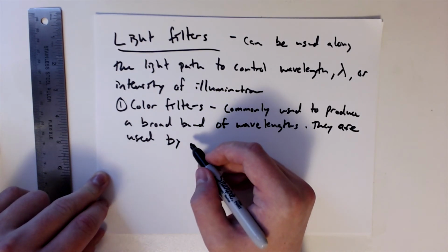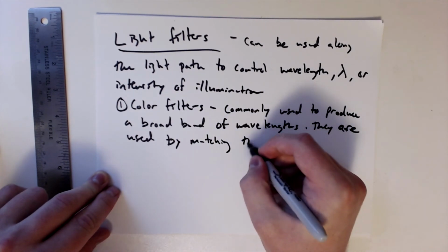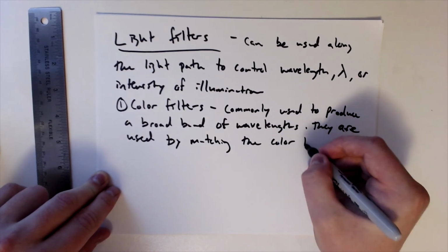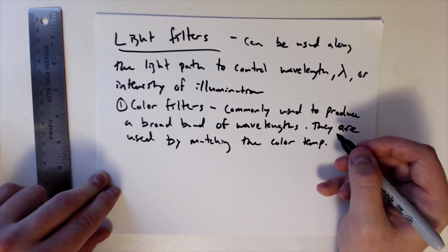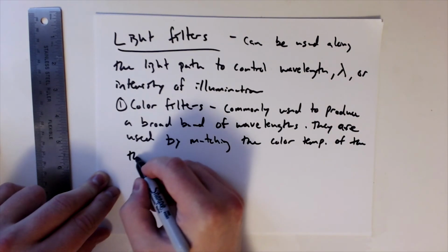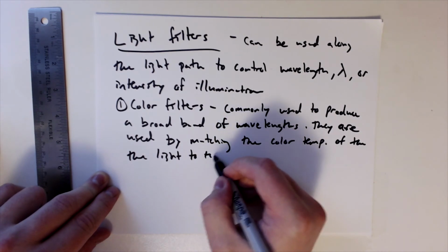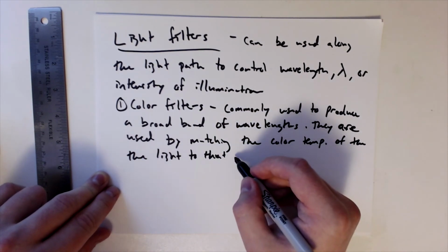They're used by matching the color temperature that we talked about before of the light to that which is required.